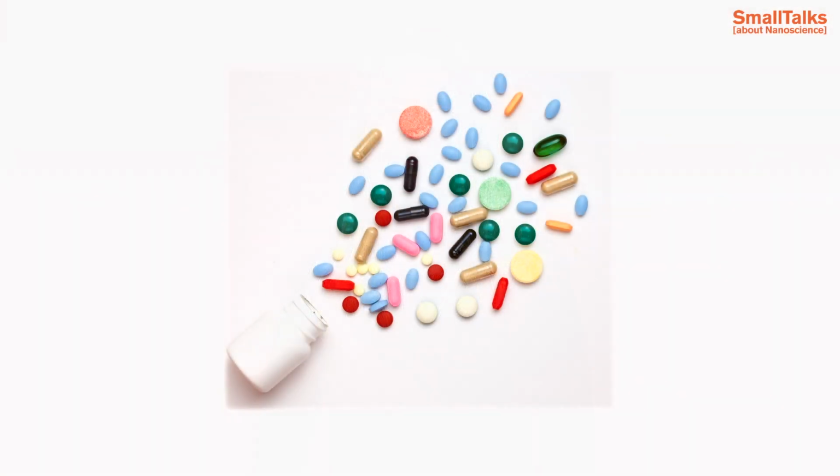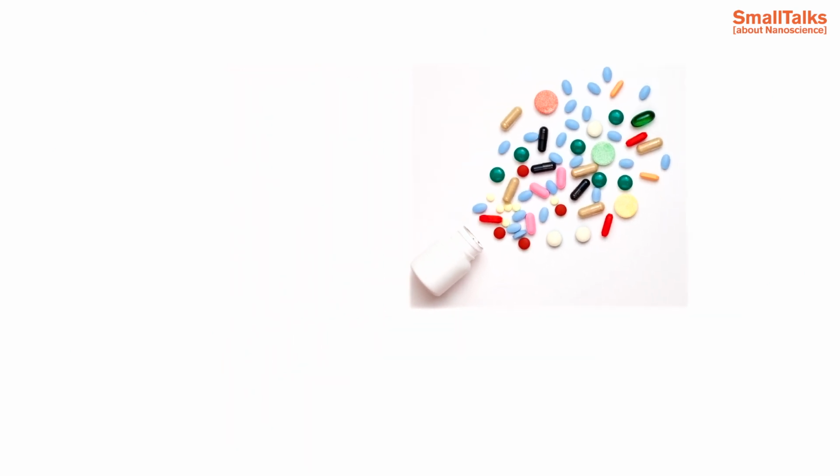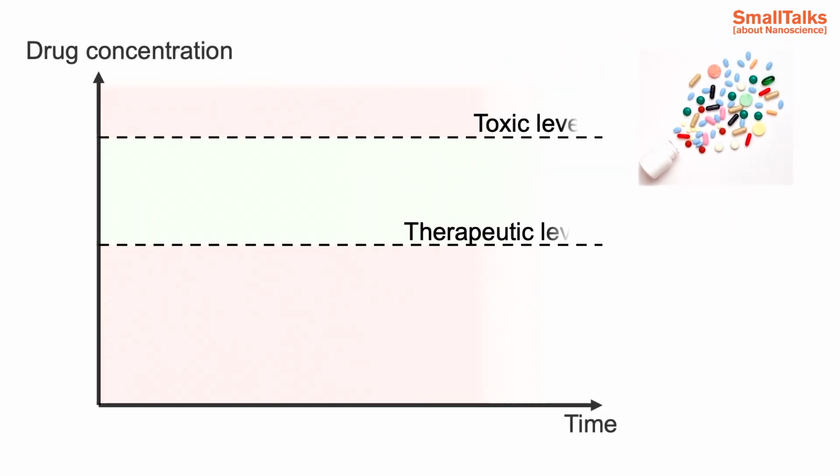I will now show one example of how we use this in my research for better understanding a pharmaceutical dosage form. In this project, we wanted to use X-ray imaging to better understand the drug release mechanism of a pharmaceutical formulation that is designed to provide a controlled drug release.